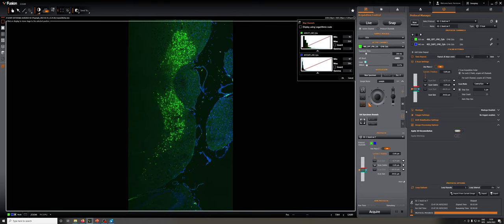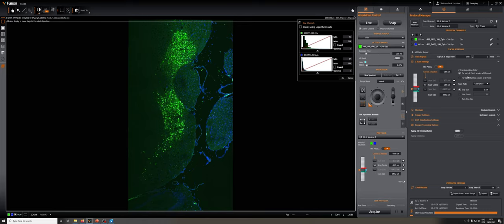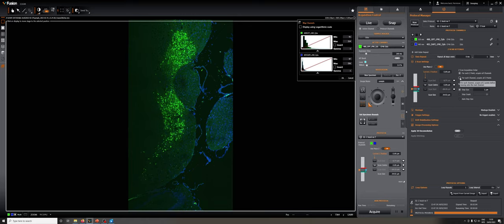Once we have this set up, it's a Z stack with no time. If we hit Acquire, it will take a Z stack there. There's one final thing: we can do for each Z point, acquire all channels. This will lead to better registration of the channels. Or for speed, we can do each channel and then acquire all the Z points for that channel. This is much faster, and that's what I'm going to do right now. I'm going to hit Acquire.